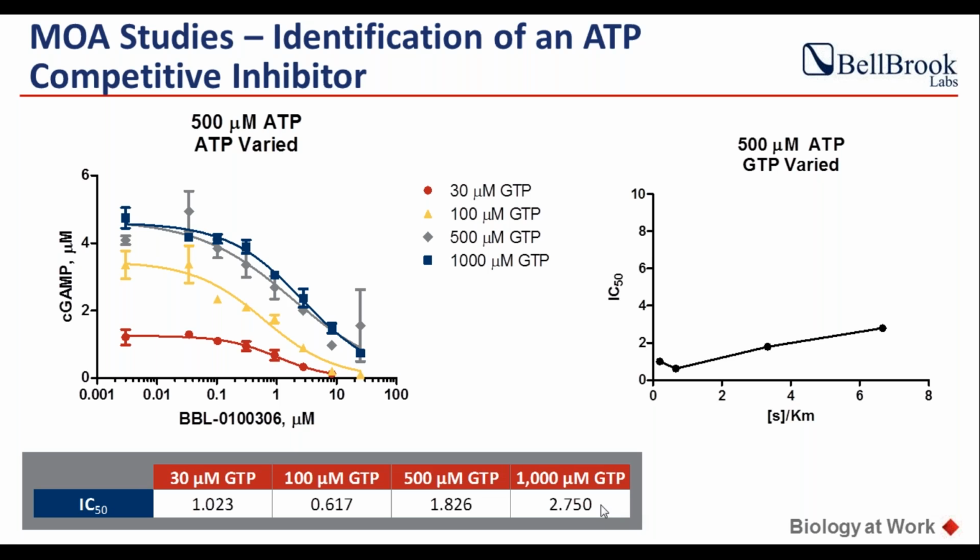if people who run these dose response curves would agree with me, a 2-fold shift in IC50 is really common. It's a day-to-day variation. It's kind of the scatter in IC50 measurements. So a change between 1 to 3 is not considered very significant. To be significant, we need to at least see a greater than 5-fold shift between two concentrations, at least according to Robert Copeland's recent publication. So we would say it's not GTP competitive, but this compound perhaps is ATP competitive.